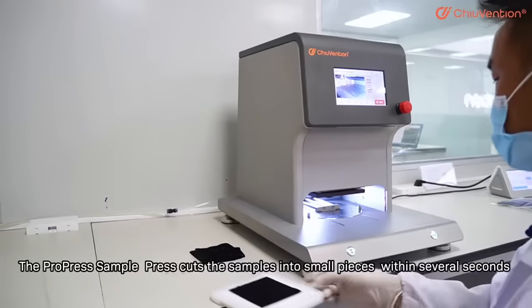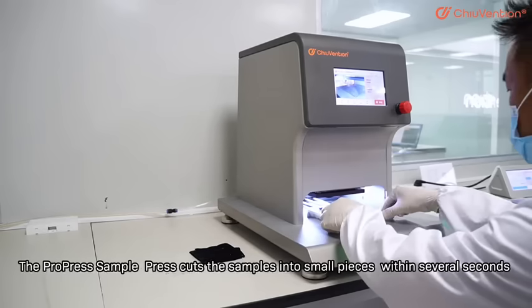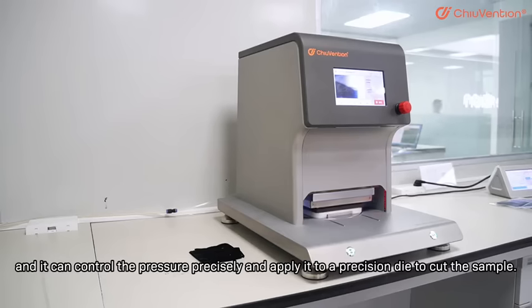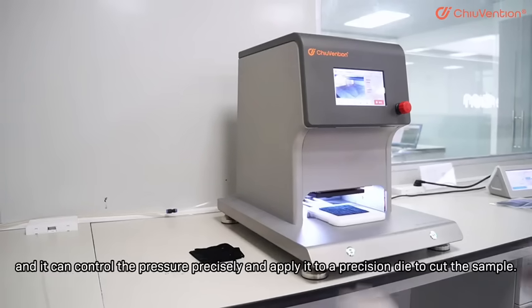The ProPress sample press cuts the samples into small pieces within several seconds, and it can control the pressure precisely, and apply it to a precision die to cut the sample.